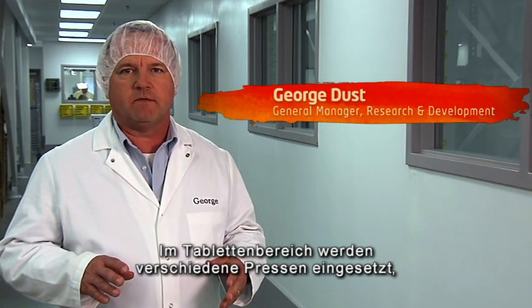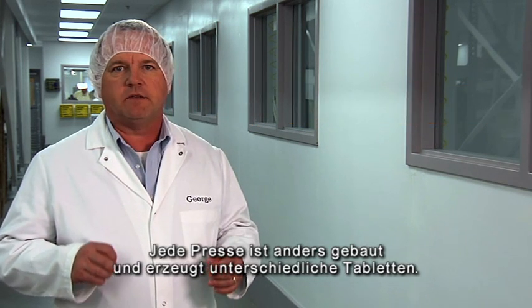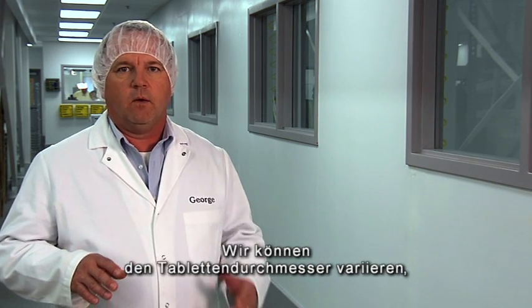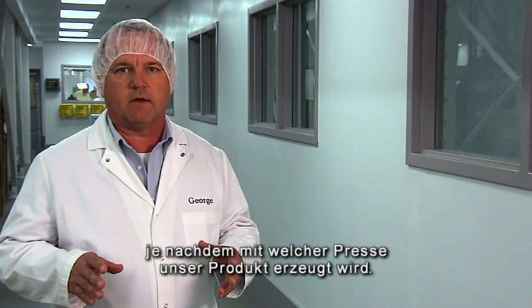In the tableting area, we have several different presses that we use to press the variety of Life Plus products. Each of the presses has a slightly different design and imparts slightly different characteristics to the finished tablet. We can alter the tablet diameter, the tablet thickness, and many of the other qualities of the tablet, depending upon which press we select for our product.